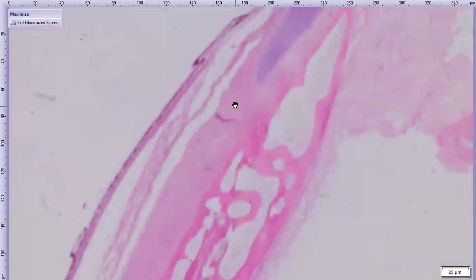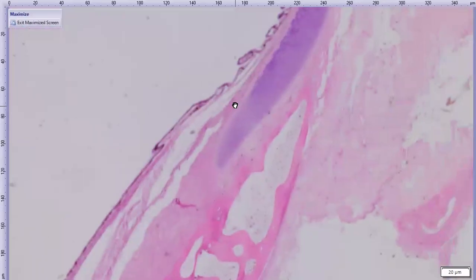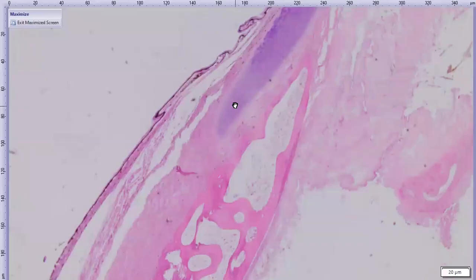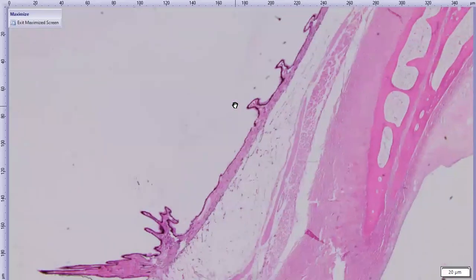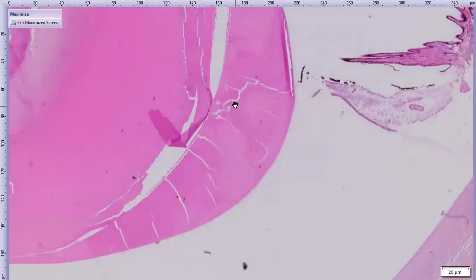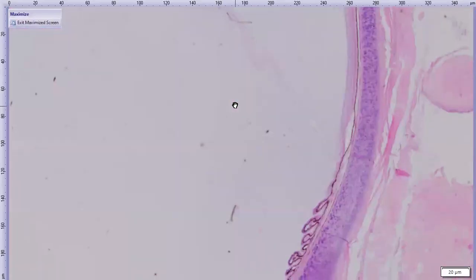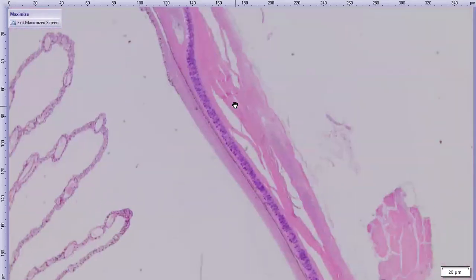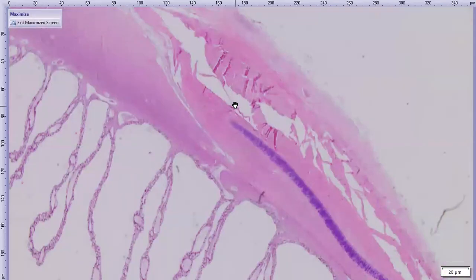So again, same thing. Here's the scleral cartilage. Is that in focus? Yes. Here are the muscles. Here's the annular pad. But we're going to look at the retina. Here's a better section of the pecten oculi.